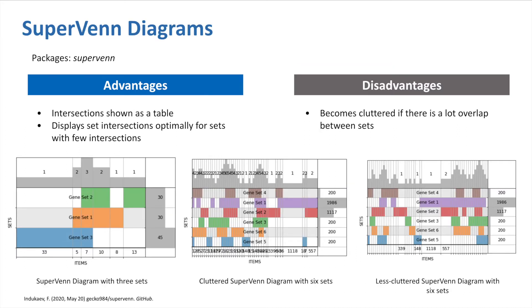Super Venn diagrams are not Venn diagrams in the traditional sense, but they display Venn diagrams in a tabular format, which can be easier to see the overlap. However, if there are a lot of small overlaps among the sets, the super Venn diagram can become really cluttered as well. But this can be fixed by ignoring the smaller intersections.